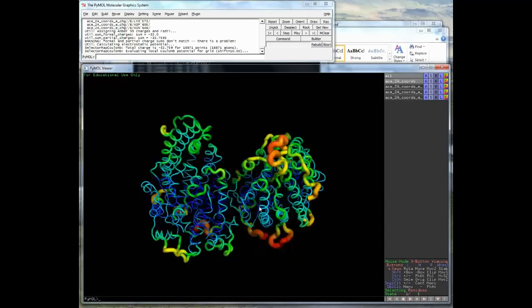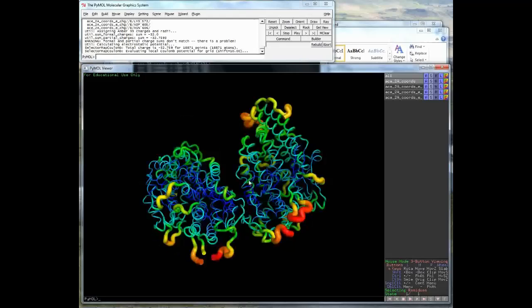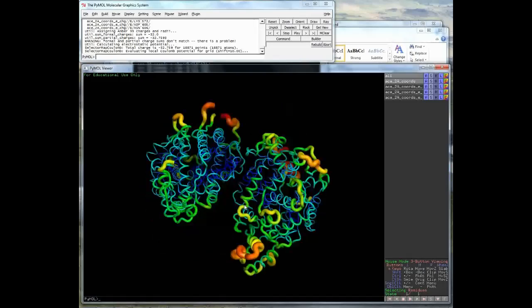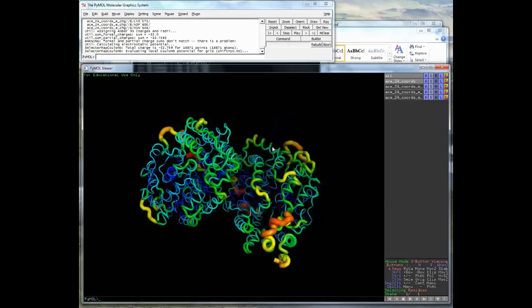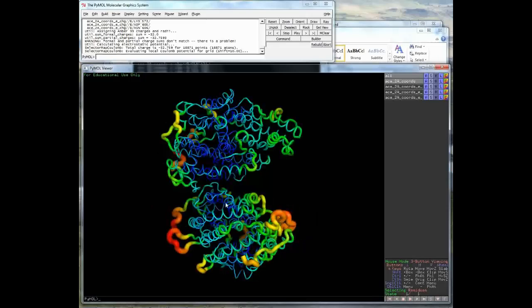So this is just a tour of some of the ways we can look at crystal structures. It gives you an idea of how we can go about analysing what our structure means, and shows you how people create all those pretty pictures that you probably see in your textbook, and how that relates to the actual information that we get out of our experiment, which is that boring text file with lots of atom positions in.